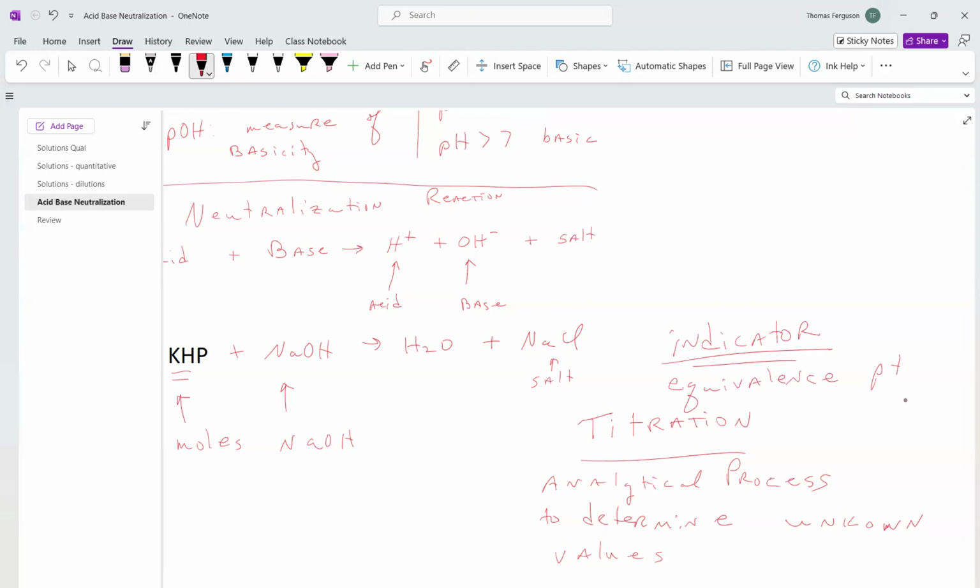It's going to be around 0.1 something, depending on how sloppy you were in throwing together your sodium hydroxide starting point. It could be 0.09, could be 0.1, could be 0.11 or whatever. It can be to 3 places. Okay, so this is the deal.